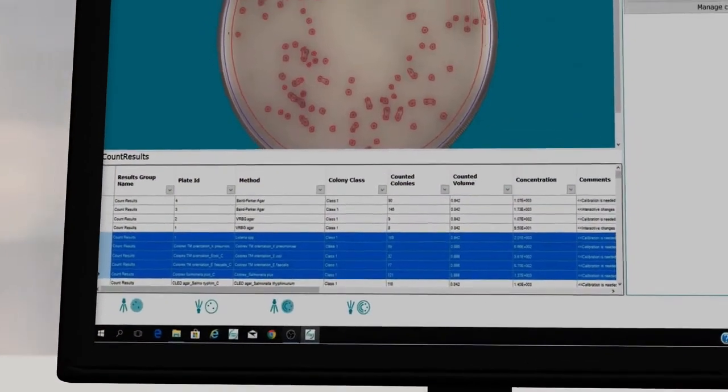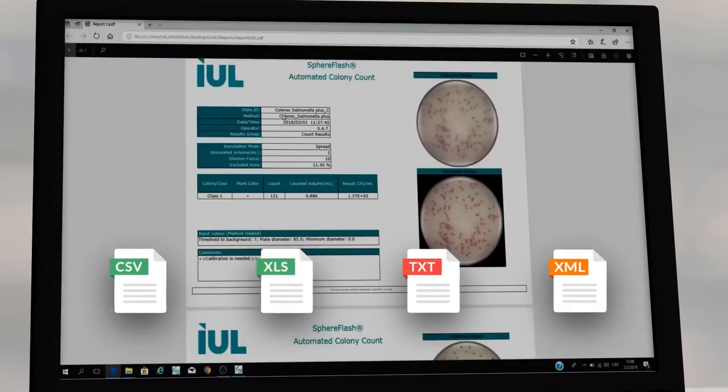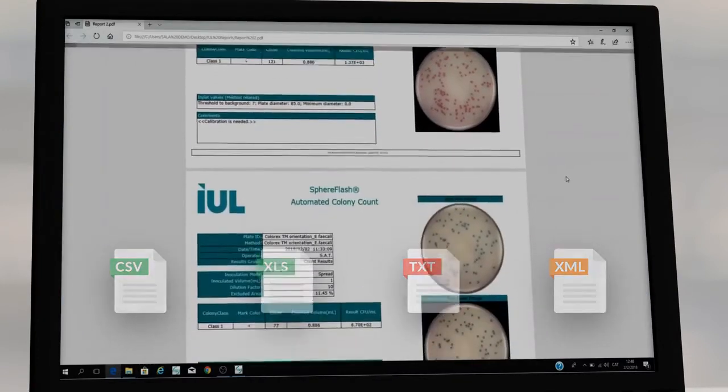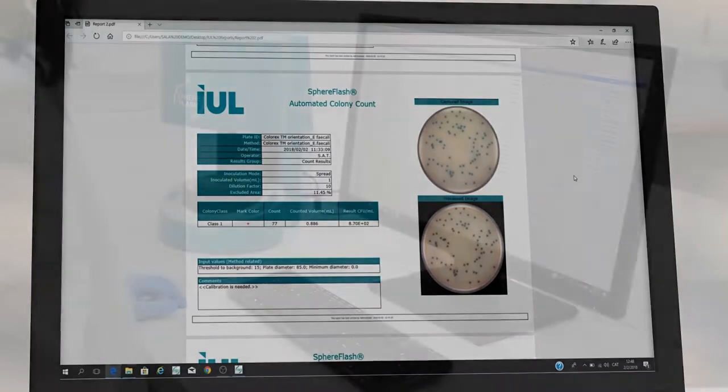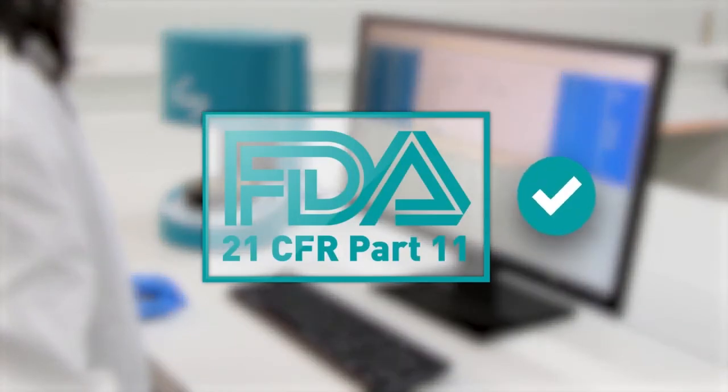Easily filter and group data, export results in various formats, or generate a customized report by selecting data from the results table. And if you need data records and traceability, SphereFlash does the job in compliance with CFR21 Part 11.